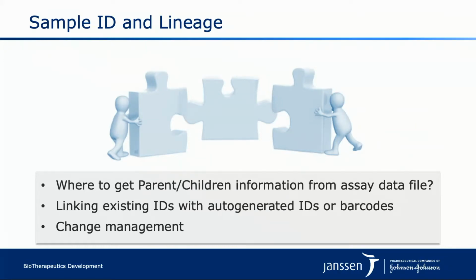Basically, in the most general cases, we get information from the assay results. But how do we incorporate the parent information into the assay data file? If we can't do that from the input in the instrument or assay instrument, can we do that some other way? And when we import those data, does the parent information already exist in the database? If not, can we create it? Those are the questions we're constantly asking.